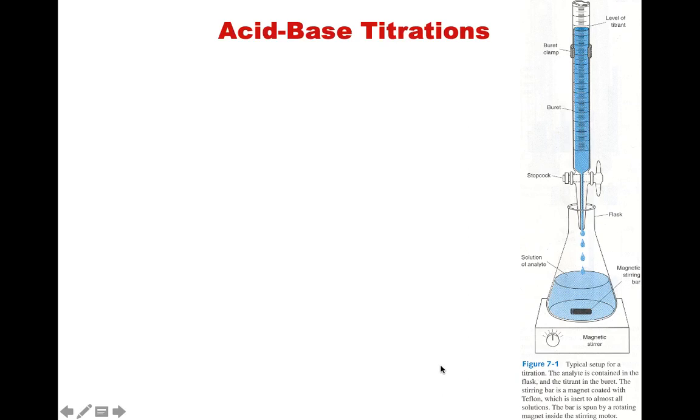Today we're going to take a look at the procedures of acid-base titrations. We had already done the calculations related to stoichiometry with the acid-base titration last week. So let's take a look at the methods.